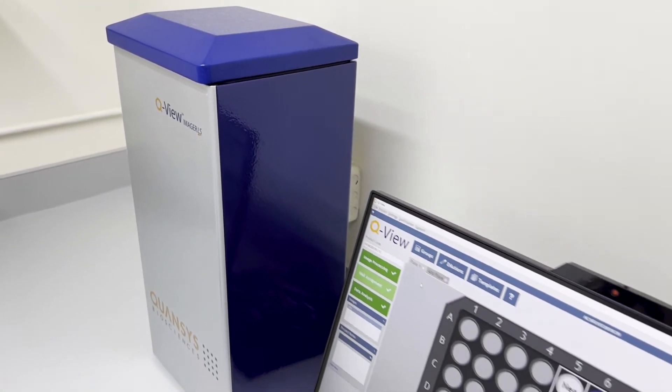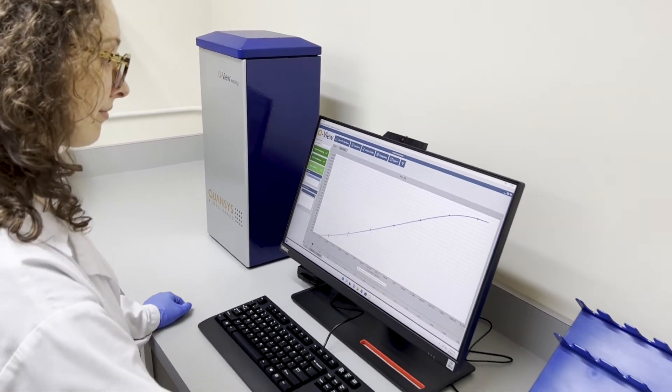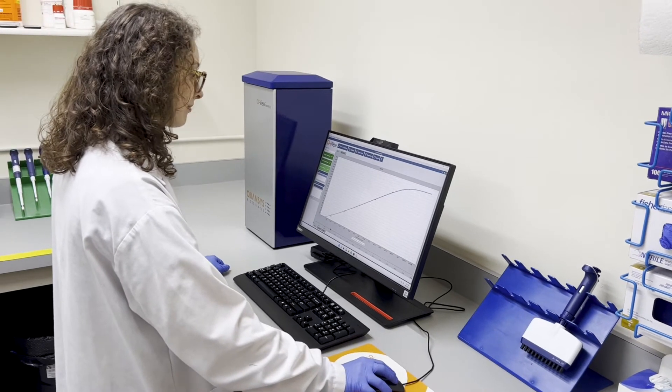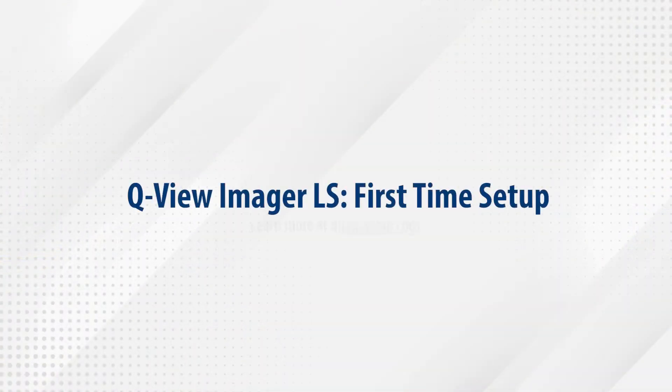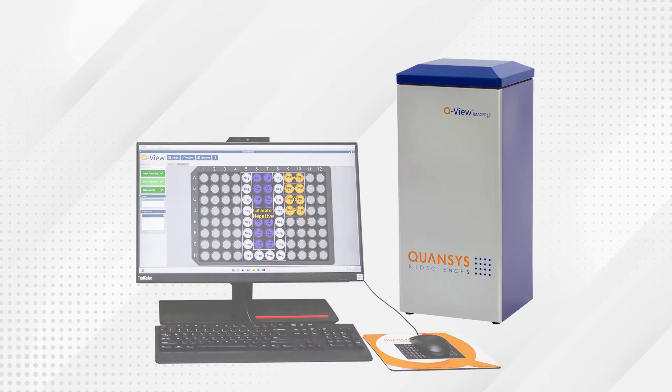Running QPLEX assays requires the use of the QView Imager and QView software, which work together to create a powerful and easy-to-use platform for detecting different biomarkers. The purpose of this video is to serve as a guide to setting up the QView Imager LS, which offers simple setup and operation to get you quickly running assays and acquiring data.